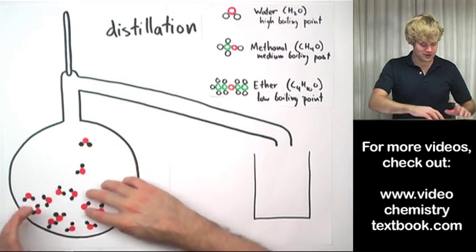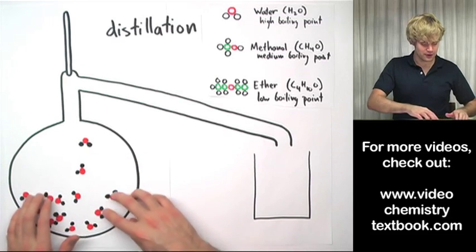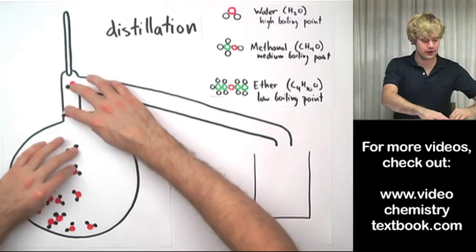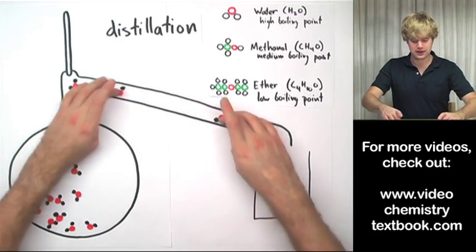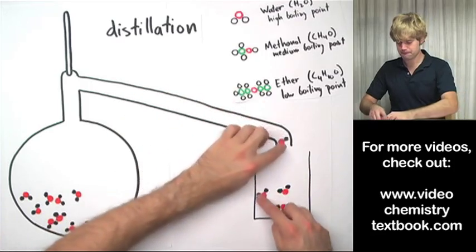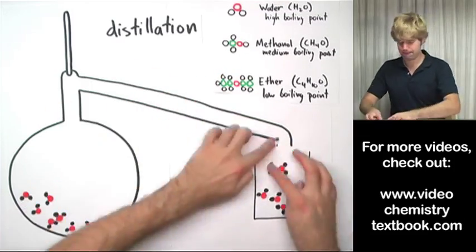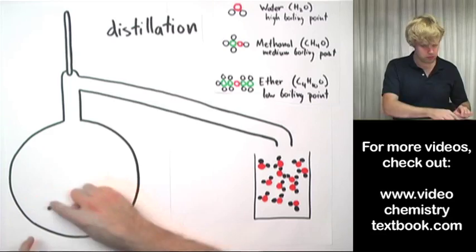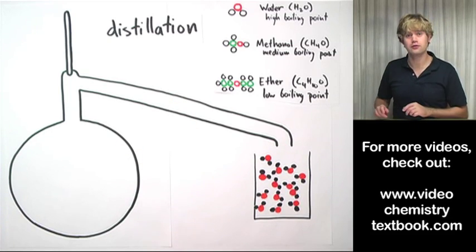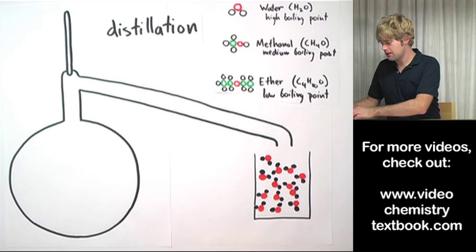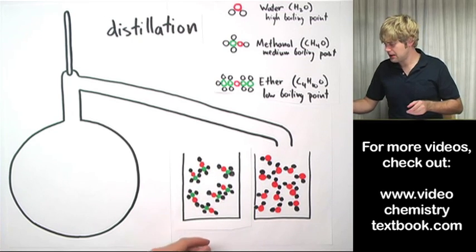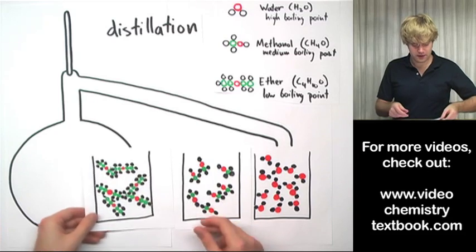And all of this water, all these water molecules are going to transition from liquid into gas. They're going to go up in this flask, through the condenser, and down in here to the beaker. And now, here is my glass of liquid water. Then I have another beaker filled with methanol, and another beaker with ether.